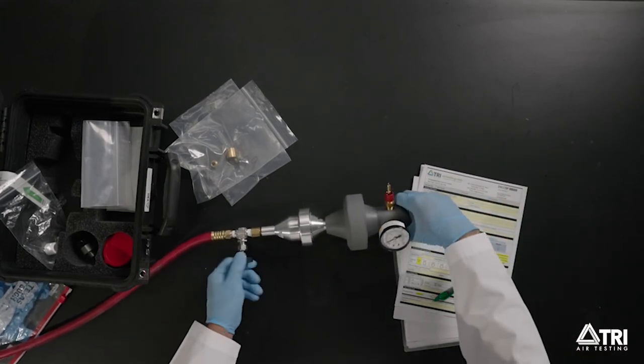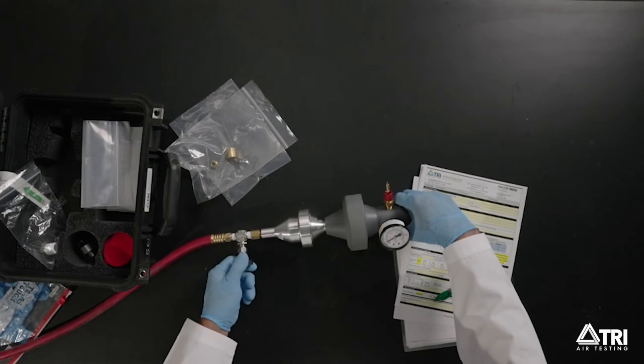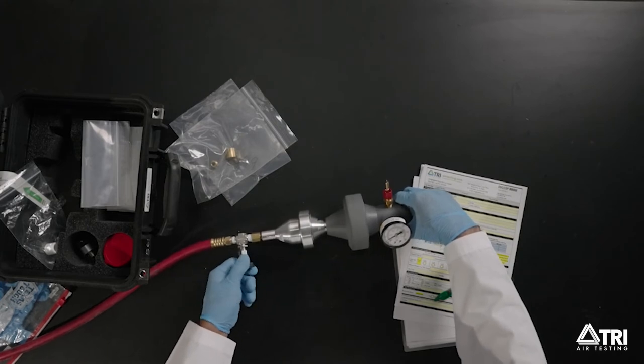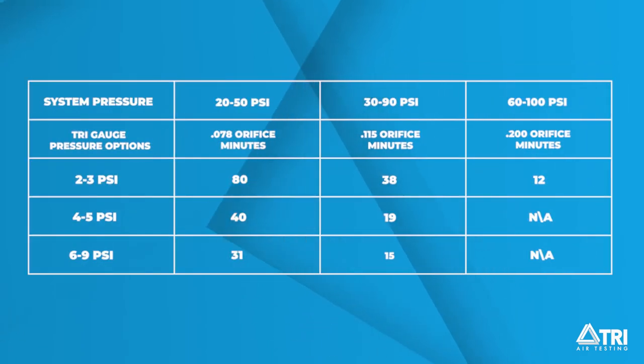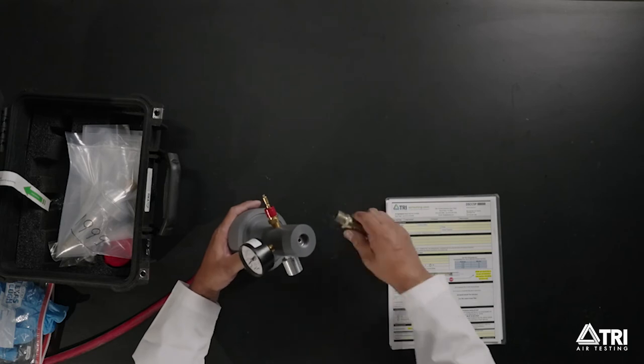Run the sample according to one of the chart option combinations of orifice size, pressure, and test time specified here. If unable to obtain at least 2 psi on the PVC flow section pressure gauge, change to the next smaller orifice plate. Then run the sample according to the chart time.